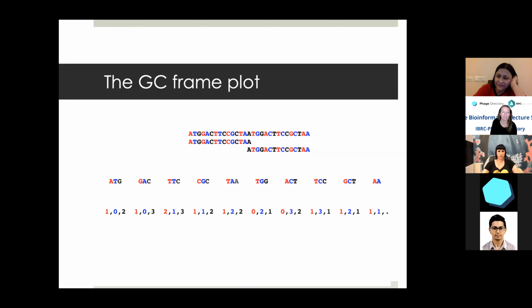Okay, here's one from Piotr. Thanks for the interesting talk, Katelyn. I'm very willing to try PHANOTATE as a Glimmer replacement in my pipeline. What is your opinion about language model usage for gene prediction? An unsupervised deep learning approach trained on a set of perfect reference genes would sound like the next step in that research area.